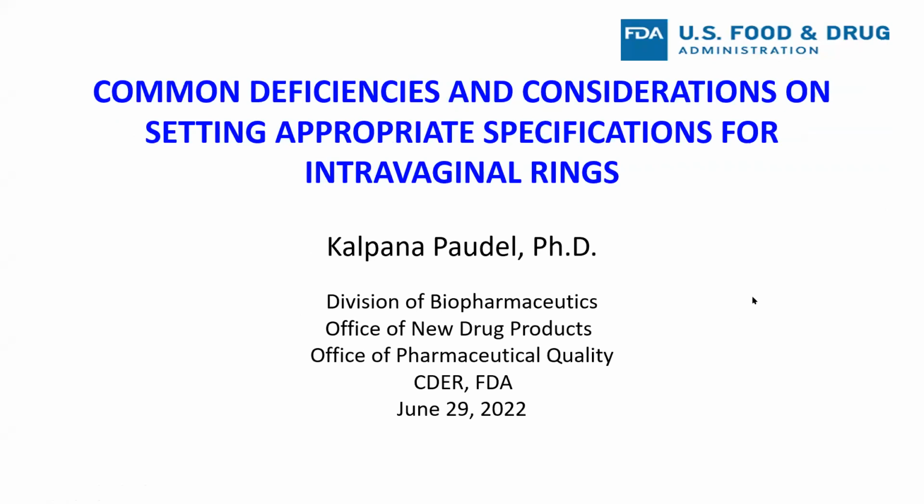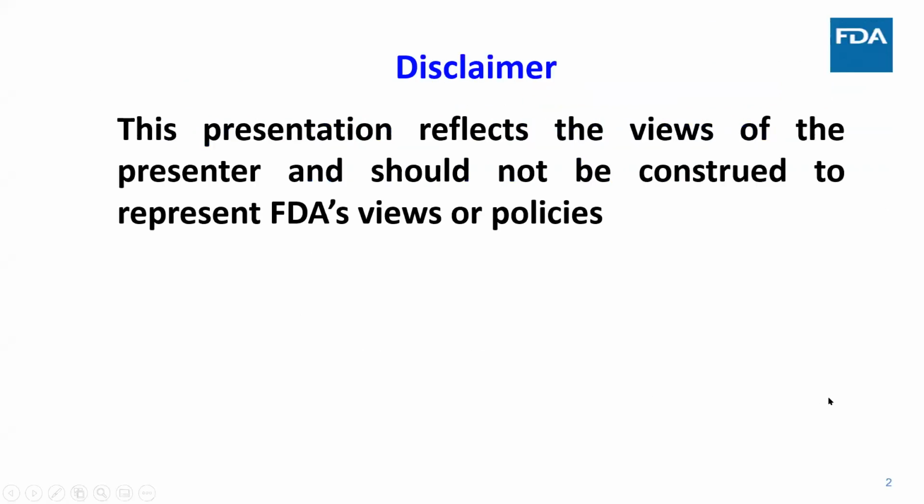Today I'm going to talk about common deficiencies and considerations on setting appropriate IVRT specifications for intravaginal rings from a quality control perspective. So before I start, here is a disclaimer: this presentation reflects my own views and should not be construed to represent FDA's views or policies.